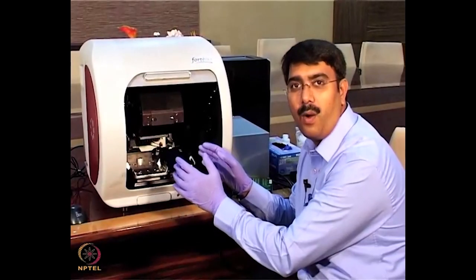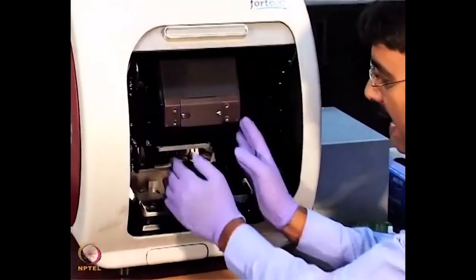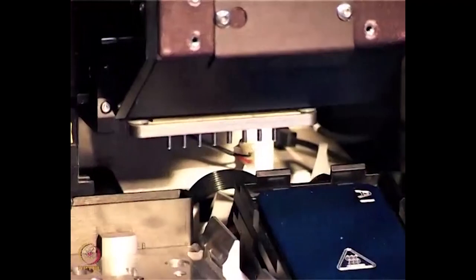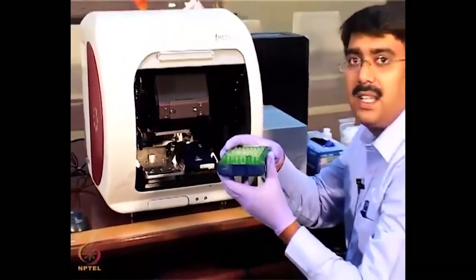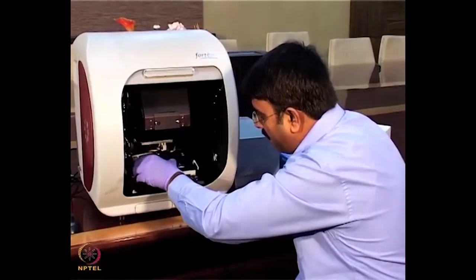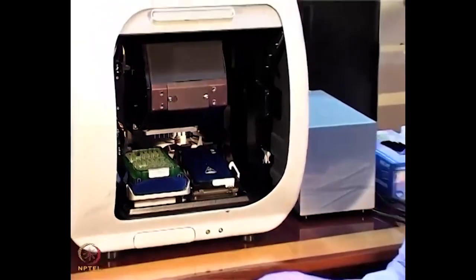This is the Pall ForteBio Octet RED96 instrument. If you look inside, this is what we call the optical head box. The optical head box consists of a spectrophotometer as well as the channels, or what we call a manifold. This is an 8-channel manifold, so it can take up 8 sensors. Here is the sensor compartment, and this is what we call the sample compartment. Now you can see this is what we call the sensor holder or sensor manifold. Here we can put the sensor in this fashion, and then we can put in the sample. This is the 96 well plate format. We can analyze 96 samples in one go.